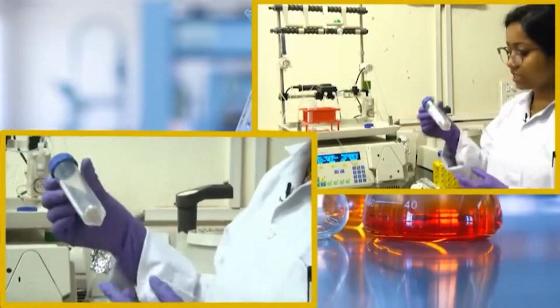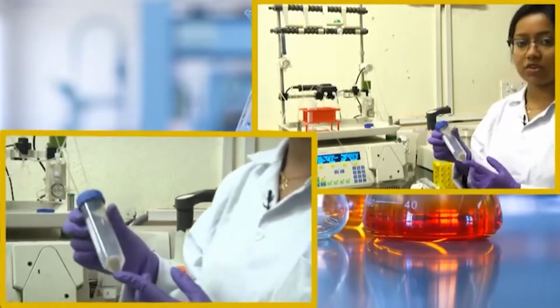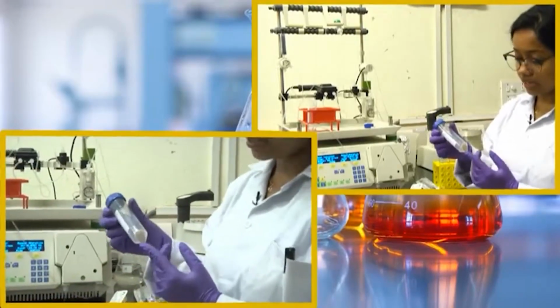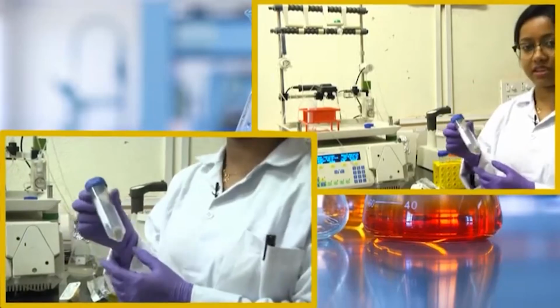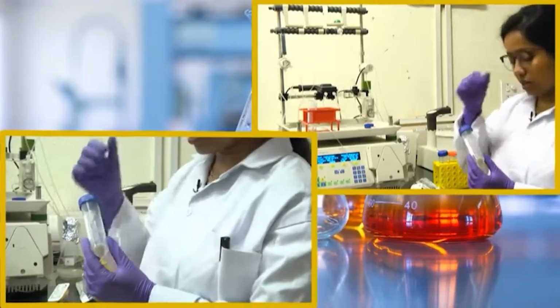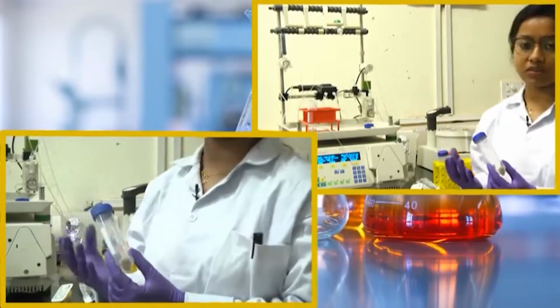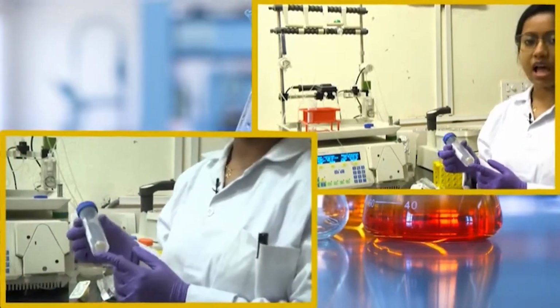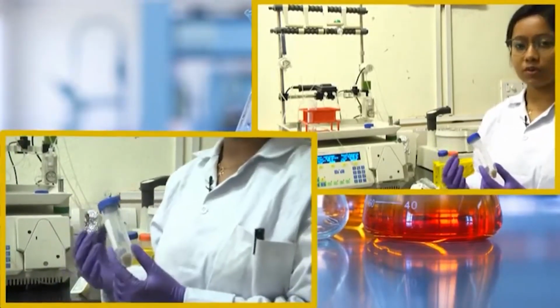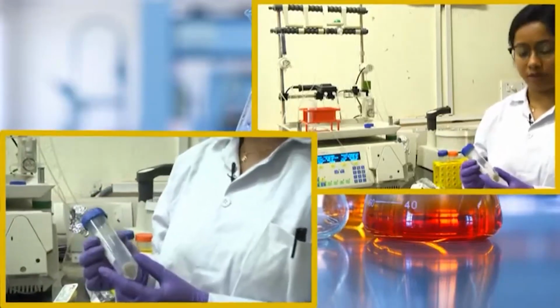But if your protein is inside the insoluble fraction or inclusion body, then you need to dissolve this inclusion body in a particular denaturing condition. Basically, you have to use 6 molar guanidinium hydrochloride or urea solution, so that this becomes soluble, and then you purify your protein, and then you have to go for refolding of your protein.